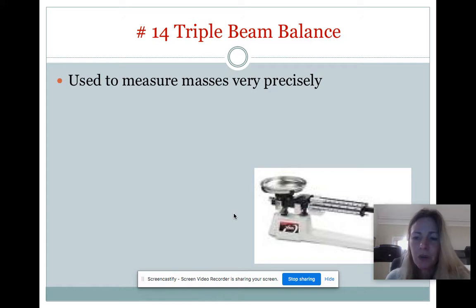So we'll most likely use those because in real lab, you never use, maybe I could be wrong, but the labs that I've worked at, you've never used triple beam balance. You always use electronic balance. And balances in biology tend to be pretty accurate. In chemistry, they're even more so, and they'll measure more effectively than a triple beam balance. Off the top of my head, maybe to the thousandth or tens of thousands of place for an electronic balance.